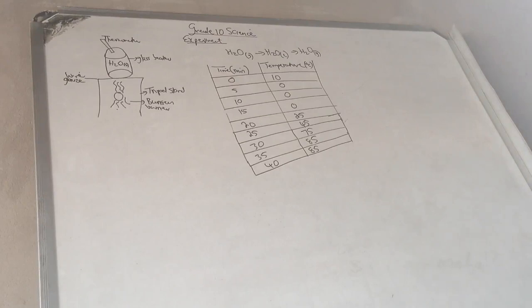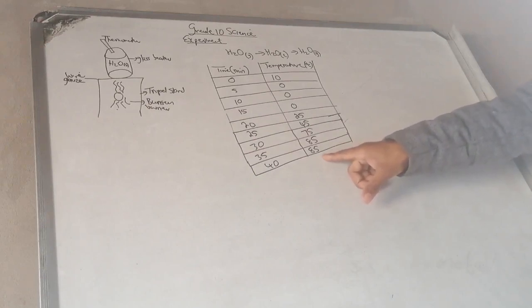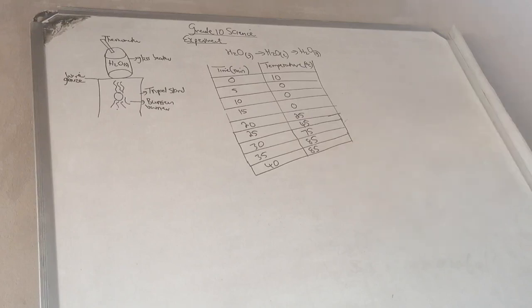I don't know whether you understand what I'm saying. Water has not even yet boiled. It is at 85 degrees. Water is vibrating at that point. It is evaporating. It is preparing itself for boiling. It is evaporating at 85 degrees. It has not yet boiled. But your teacher, already the experiment was done. Because water boils at 100 degrees, and they said we should allow it to boil for 3 minutes. It has not even boiled, but your teacher was done.